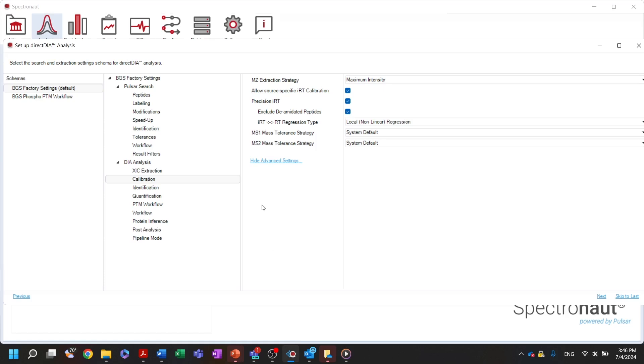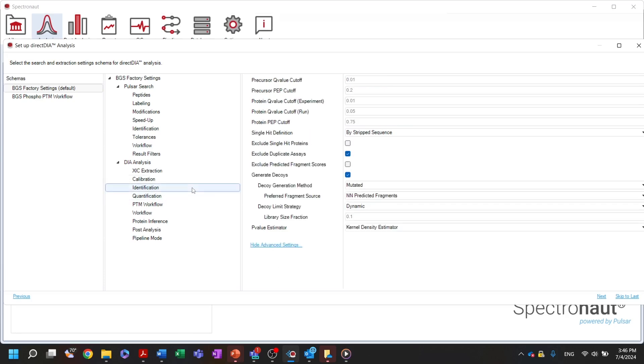In the identification settings, you can set up Q-value cutoffs at the protein and precursor levels. You can also exclude single-hit proteins from the list of identified ones.